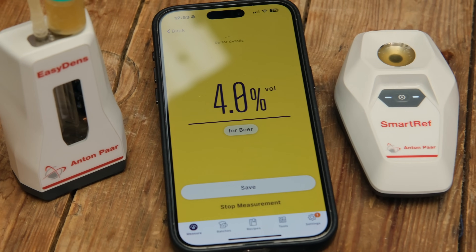That just shows how easy these things are to use, and hopefully shows why we're so impressed with these pieces of kit. We totally get that these aren't for everyone, but we've really integrated this into our brewing process here at the Malt Miller. Pretty much every brew now, we're using these just to reconfirm what we're expecting of our results. Being able to take samples during fermentation without having to sacrifice too much beer makes a big difference, and being able to log those really accurate results has been awesome. The thing that's really blown me away though is using both of these in conjunction — being able to see exactly where the ABV is on finished beer or beer that's during fermentation is really cool.